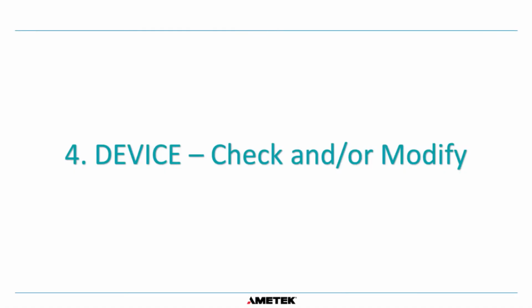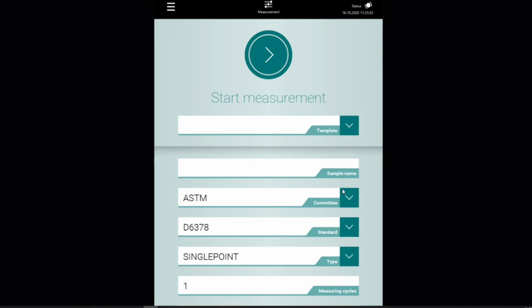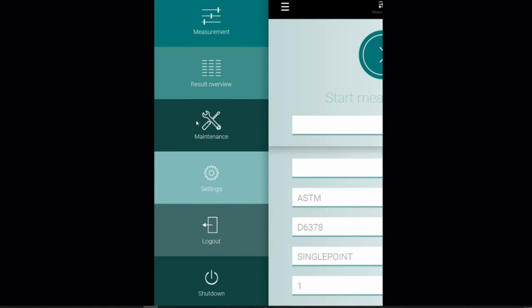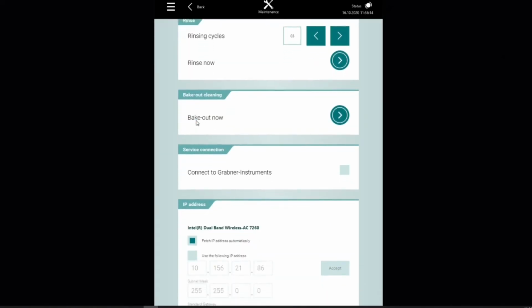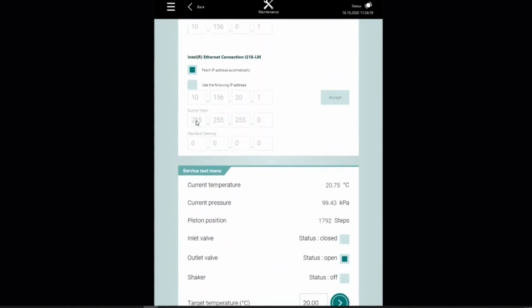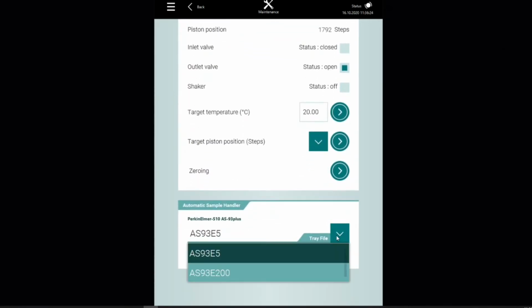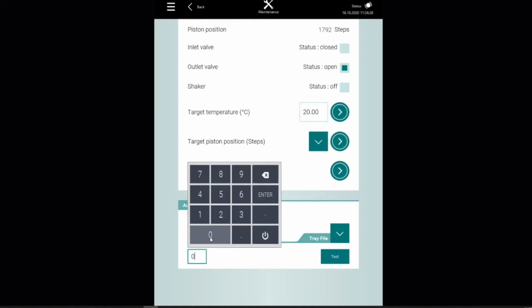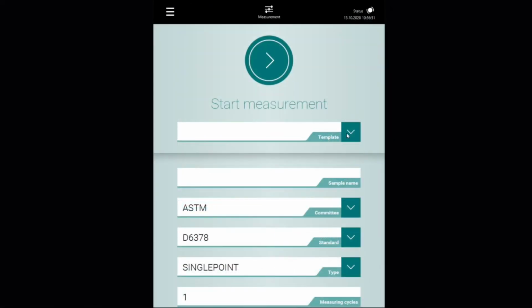Step 4. Check tray file and playlist on the device. On the instrument, log in as Lab Manager. We will first check if the configuration really works before starting on real samples. Enter the maintenance menu, then scroll to the bottom of the page. From the automatic sample handler, select the tray file just transferred. Test different positions and verify that the sampler moves to the expected place.